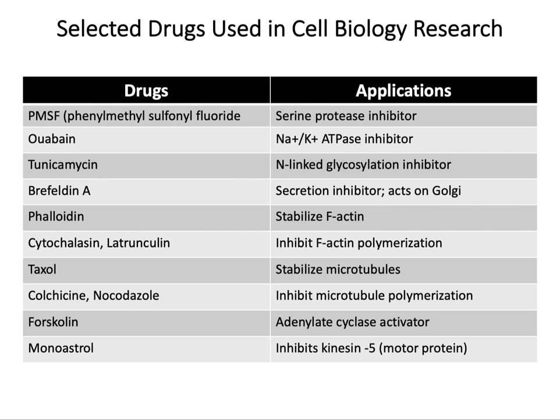For example, a very common compound, PMSF, is used in the media whenever you break up cells to isolate organelles, proteins, or nucleic acid, or do other biochemical assays. The reason being the cells are loaded with serine proteases, and as soon as you break open a cell, the vesicles and lysosomes containing them will also break. And these proteases will degrade many proteins quickly. To prevent the protein degradation, PMSF is routinely used with many other protease inhibitors as well.